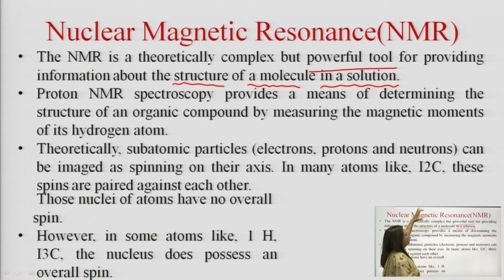This electromagnetic radiation will impact the energy levels of the nuclei, and various changes could be registered, and the compilation of all the complex changes is recorded, and then the structure is computed.